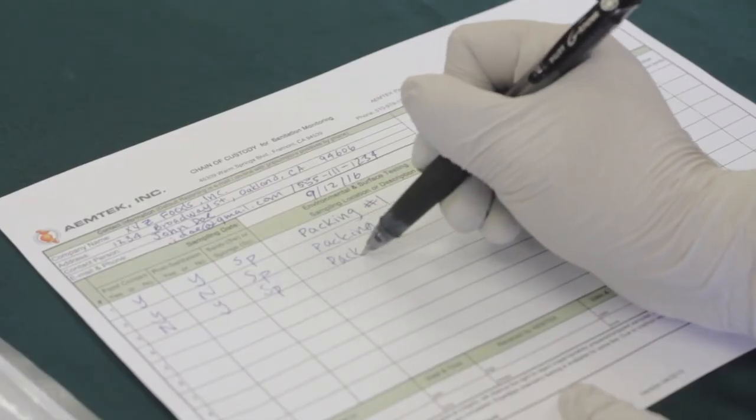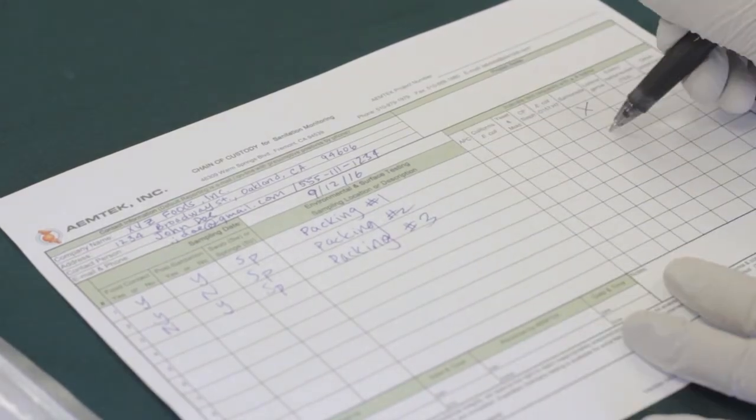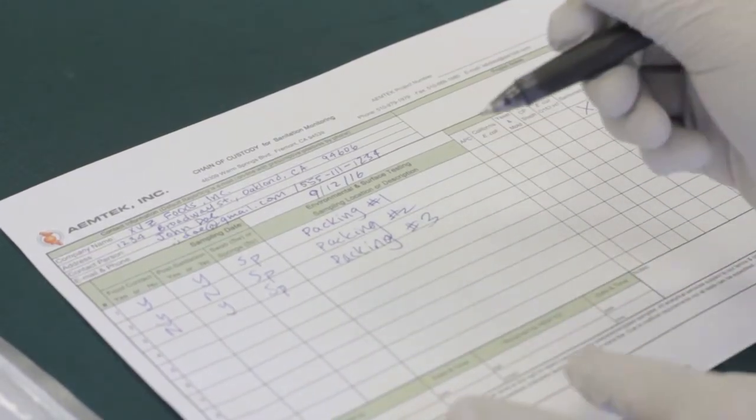Record the sample information on your sample submission form or chain of custody form. Make sure to check off what type of testing you would like the lab to perform on the sample.